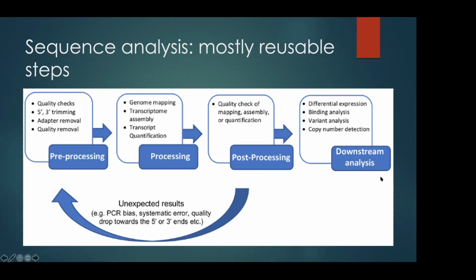And the downstream analysis is a world of its own. So after pre-processing, processing, and post-processing, in DolphinNext we entered downstream analysis a little bit more, where we do differential expression analysis and those kinds of analysis in DolphinNext too. But there are many other things that you could do yourself, or many third-party tools you can use, like Jupyter, for example. Upload your file there, and use other people's analysis methods and get your results.